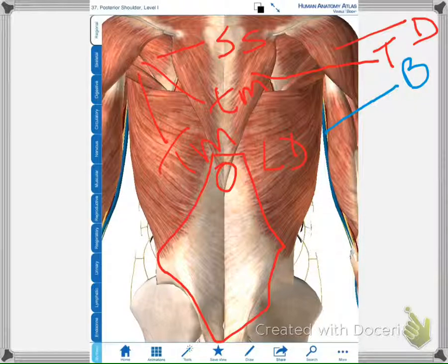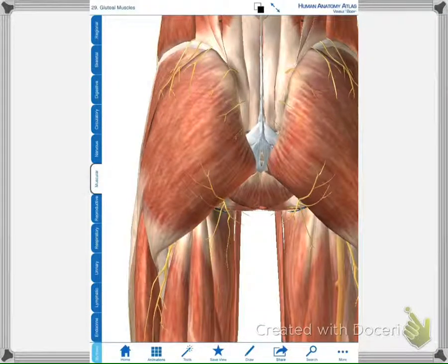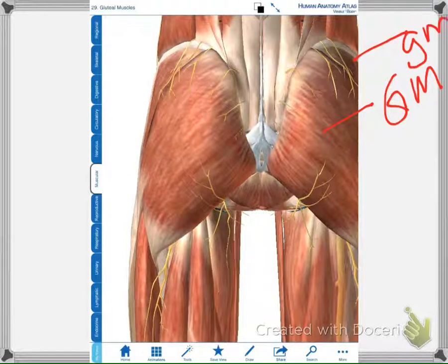This is indeed very thick, and as you do your dissection work trying to get underneath the muscles, you will find it exceedingly difficult to dissect it in that area. Here we are viewing the gluteal region, and this is our gluteus maximus, and up here, right adjacent to the iliac crest, is our gluteus medius. Gluteus minimus is not viewed from this aspect.